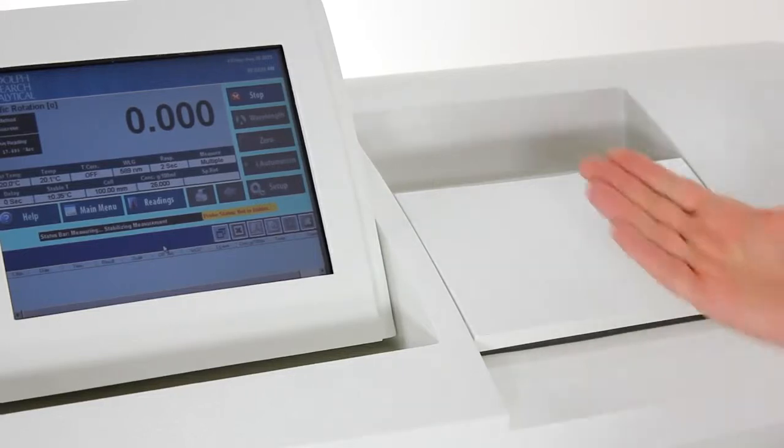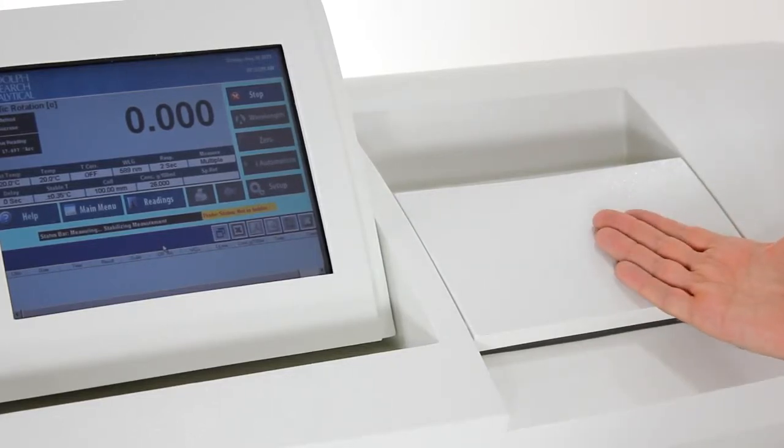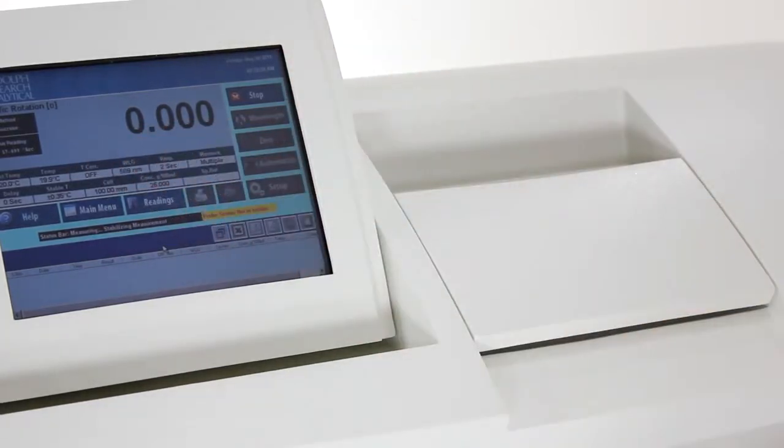The system now will bring the sample to the required temperature. For sucrose this is 20 degrees. For other materials that may be 25 or even at different temperatures.